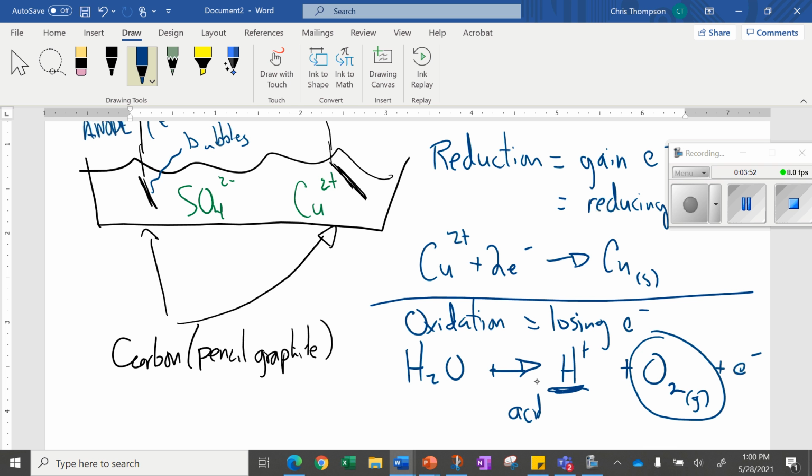So you saw both those things happening again. When you observe this, in all these cases, you saw solid metal forming on the end of my carbon electrode on the cathode. And then on the anode, you saw bubbles being formed and a color change happening. If you tried sodium chloride, like table salt, it was a little bit different. If you want to use that, feel free, but that's maybe a little bit extra to do. So that's how you could summarize this one.